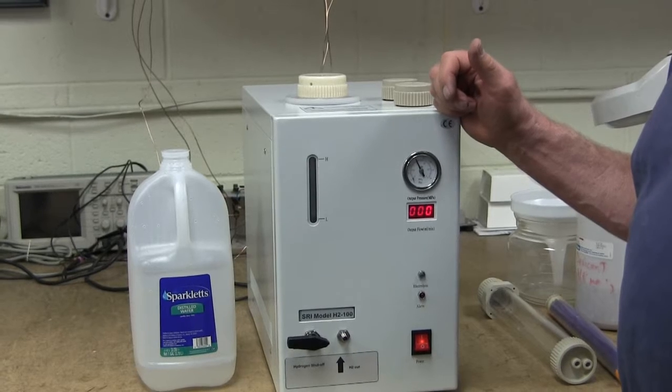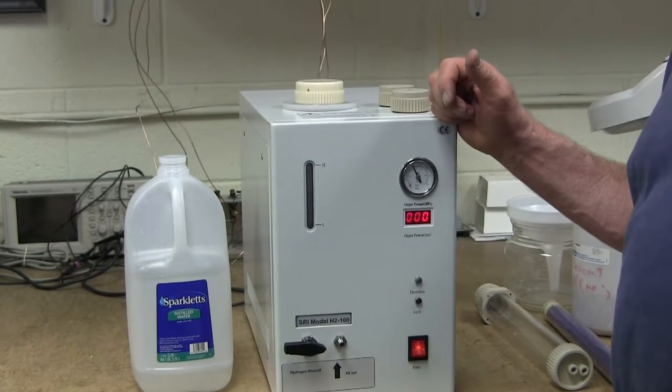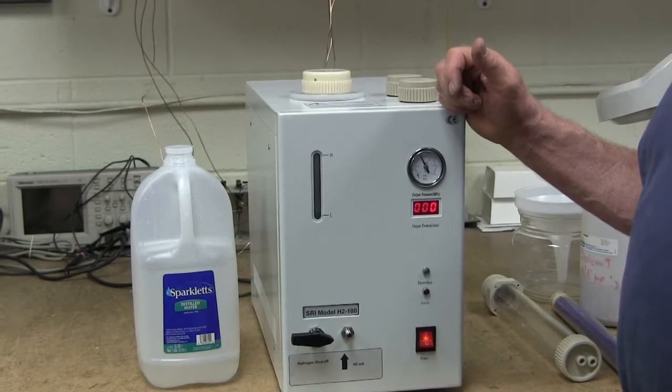This makes up to 150 milliliters per minute of hydrogen using a proton exchange membrane cell.